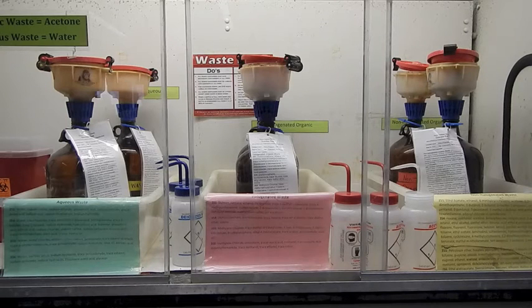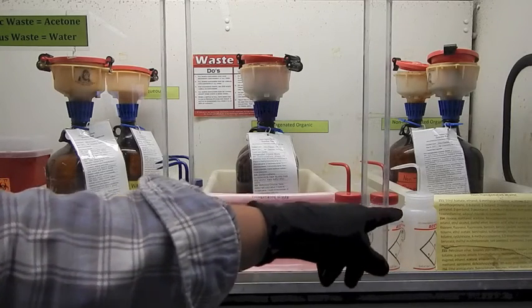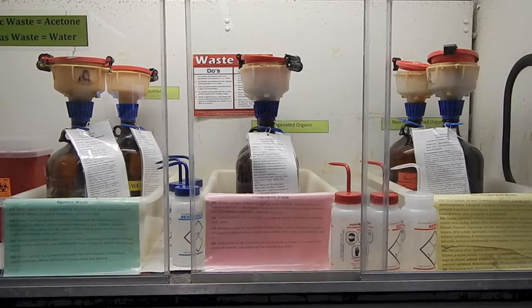So in 354, the waste is treated a little bit differently than we've treated it before in the 100 level lab series. So we've got 3 main waste jugs. Sometimes we will have an extra separate waste jug for special things, but most of the time your waste is going to go in one of these 3 waste jugs. So on the right hand side we have non-halogenated organic waste. If you have organic waste, things like acetone washes, those are going to be in the non-halogenated organic waste.